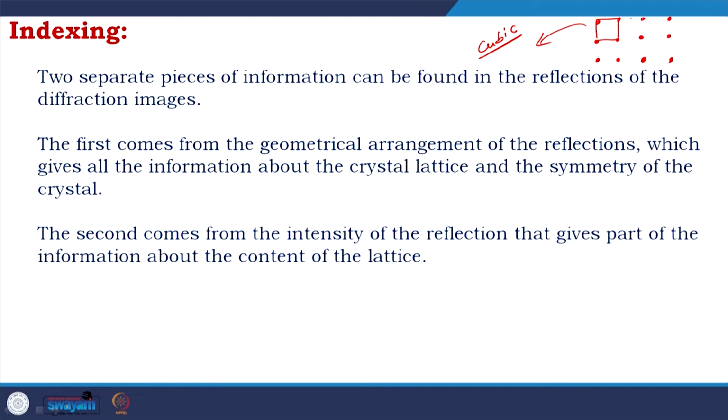You choose something which is in a different setting, and both are possible. So, whatever your crystal is, even if A and B are doing identical experiments, they could come up with different unit cells. The choice of unit cell depends on your choice of model.